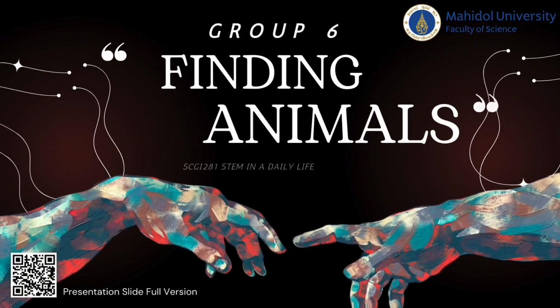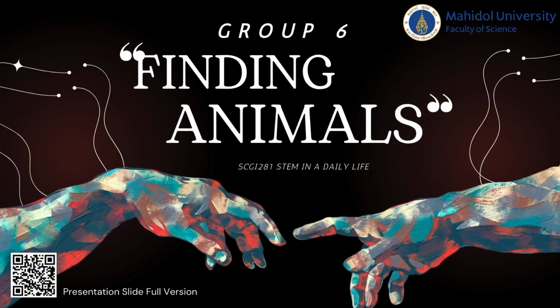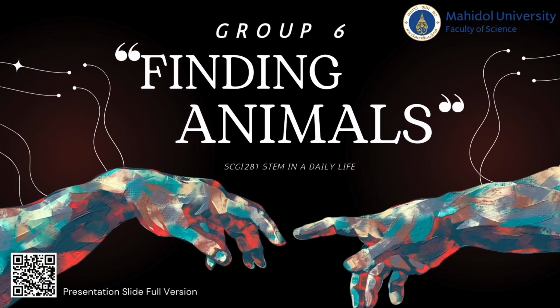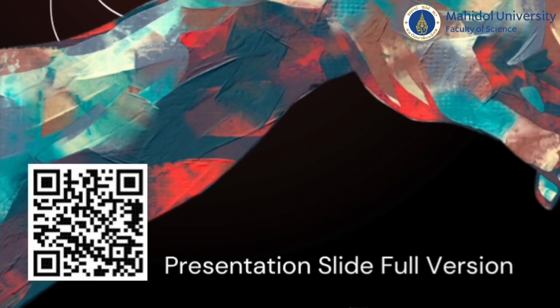Welcome to our STEM activity, Finding Animals. By using the knowledge of gel electrophoresis, we are second-year bioinnovation students at Mahidol University. In this video, we will show you an example situation and activity to apply the gel electrophoresis concept, and to make it easy for everyone who wants to use our activity as a teaching tool, we made the full version of the slides in the QR code attached below.